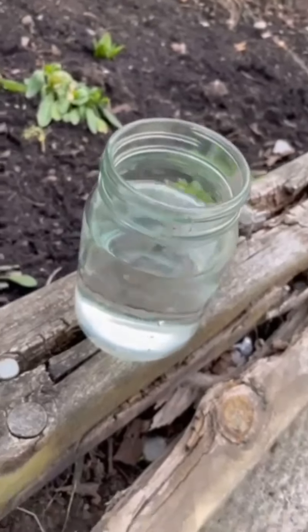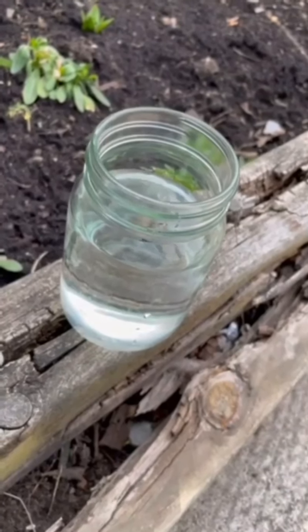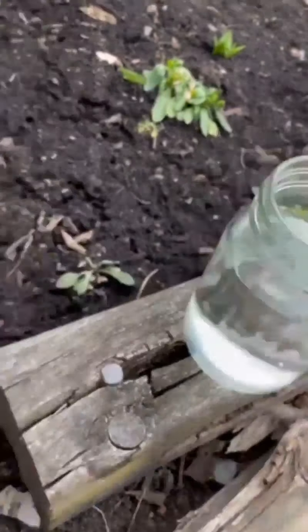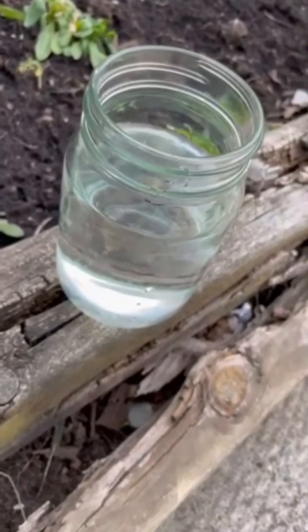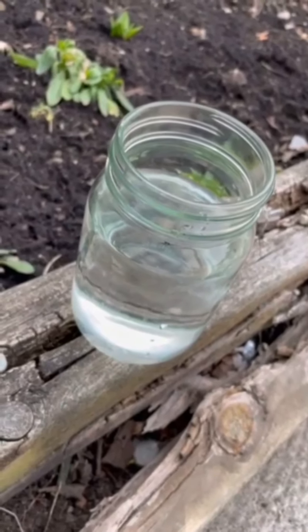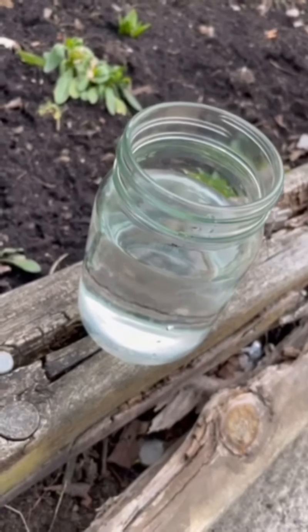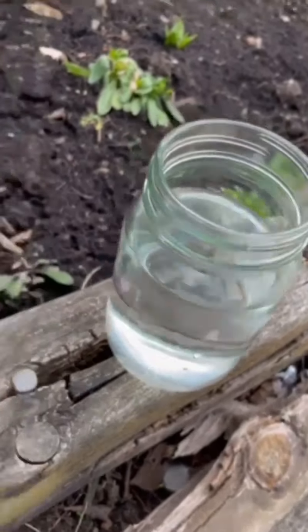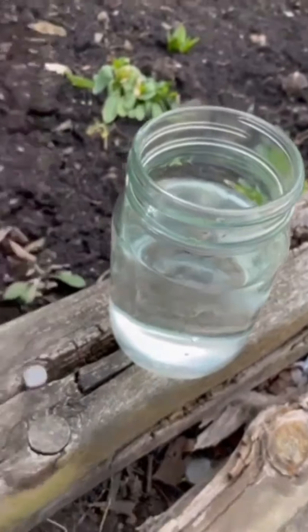This is my first video of trial 2. I'm going to make the soil solution, putting the soil into the tap water and then swab it onto the agar plates. Last time we used the dirty plates, but the microorganisms did not appear properly. That's why we are using the soil and the tap water, for a better result.